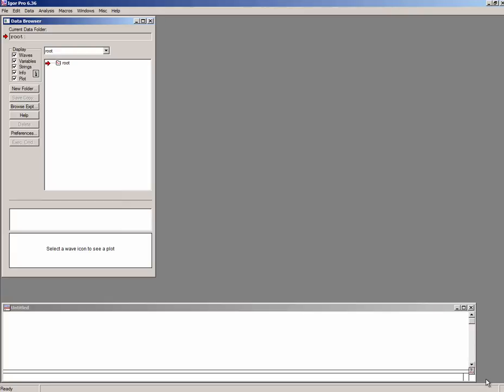Welcome to a demonstration of IRENA capabilities to fit two populations of nanoparticles. In this case I want to show you a more or less mechanical type of analysis of small angle scattering data provided to me by a user. Ideally this analysis would be directed by very good scientific knowledge of the problem and lots of other information from imaging and other techniques which would guide me to the right solution.